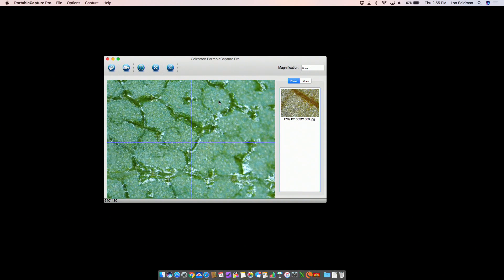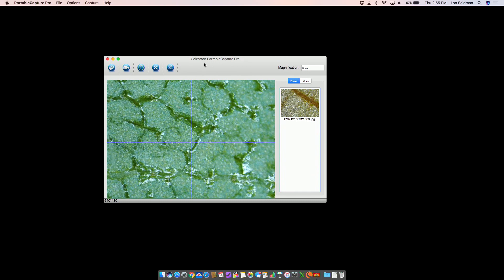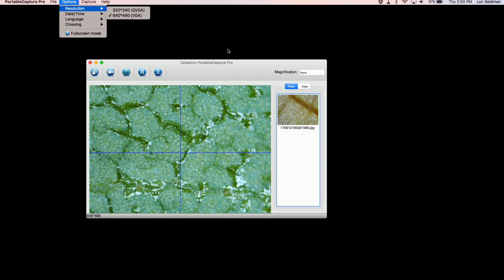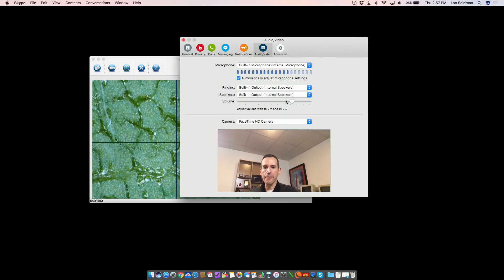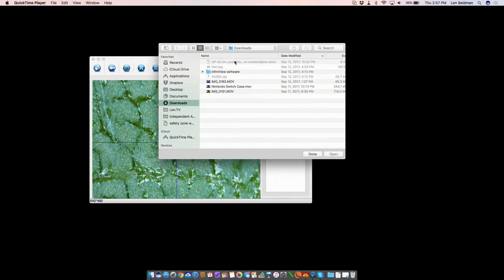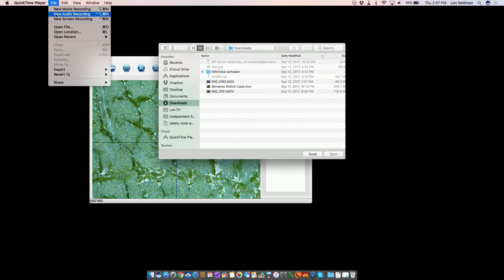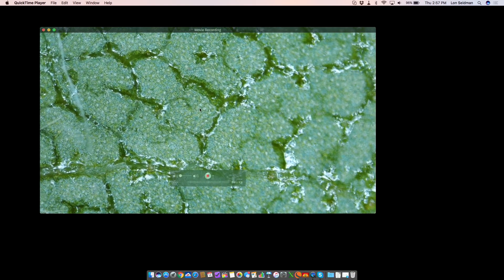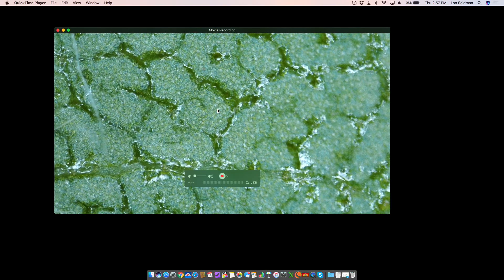Let's take a look and see what happens when you hook it up to a computer. Here's the software running on my Mac — it's called Portable Capture Pro. I did have to get this from their website. They do give you a disk in the box for Windows, but for Mac you have to get it over there. One thing I'm noticing with the Mac version is that it does not go up to 720p — the best it can do is 640x480. Mac users are not going to get the full effect using the Celestron software, but it works just like a webcam when plugged in via USB so you can record it with other applications. I've got Skype up here right now — I could even make a Skype call with it. One way on the Mac to work around the limitations of the built-in software is to use QuickTime. I can go to New Movie Recording and that will bring in the camera at its native 720p resolution over USB, and you can make movies that way.